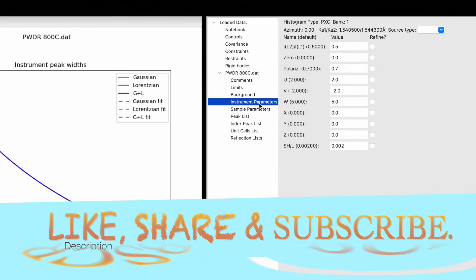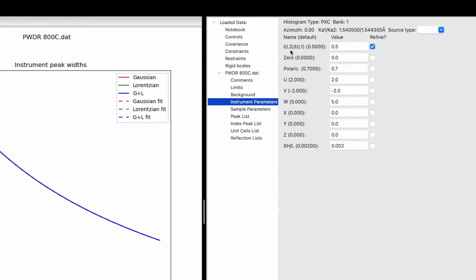Then we will go to the instrument parameters. Here we can see azimuth is 0, and Kα1 and Kα2 are 1.54. Remember that you need to refine this factor — the intensity of L2 and intensity of L1, which is by default 0.5, but it will vary depending on the contribution coming from Kα1 and Kα2.